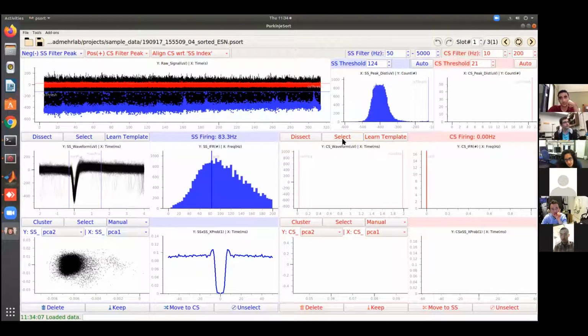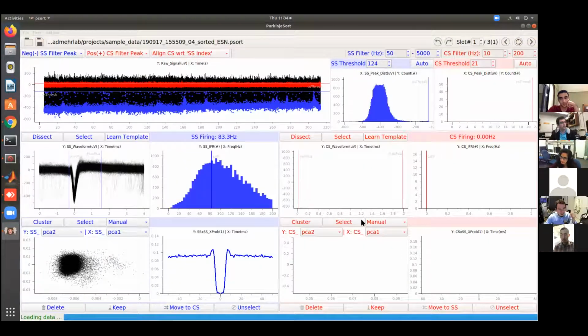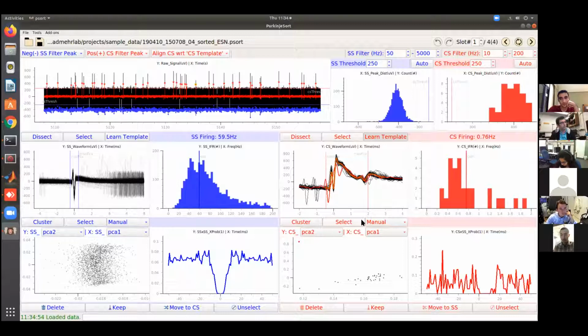Go ahead. Sorry, can I just ask a question regarding the previous one? Let's imagine you have multiple slots and you are doing a learning paradigm, right? And basically the excitability of the Purkinje cell is changing over time. So you might imagine that you will have a number of spikelets that might change over time too. Would you be able to catch them, or would you need to cut in very small slots to make sure that it changes smoothly over time, or what would you recommend if it was the case?